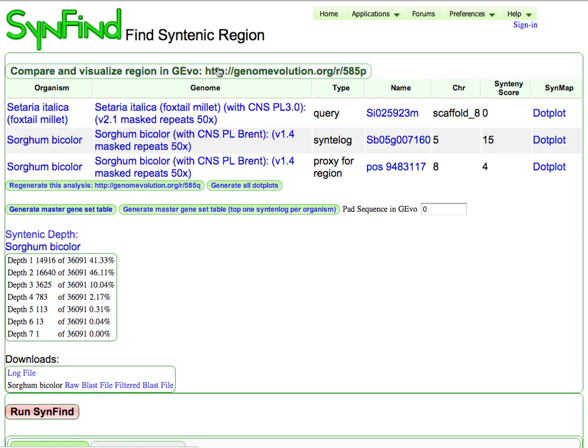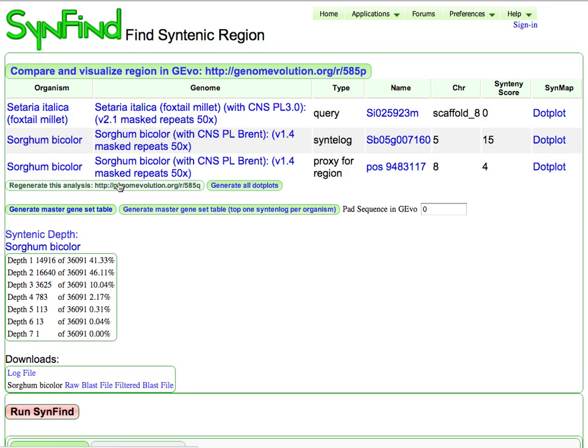So if I wanted to, I could fire up GEvo and analyze all these regions in high detail. I have the ability to generate syntenic gene sets across all these genomes and generate these master tables. I can regenerate this analysis.